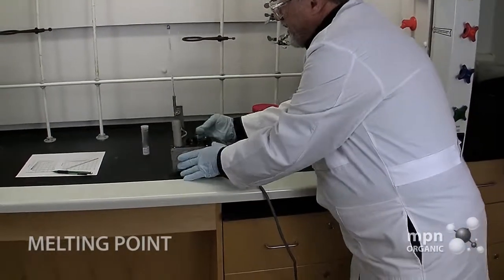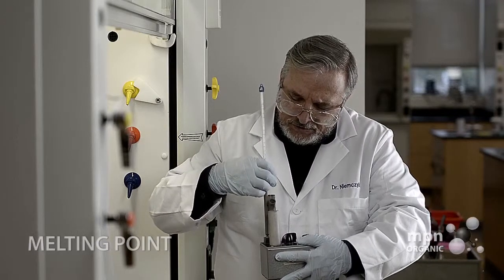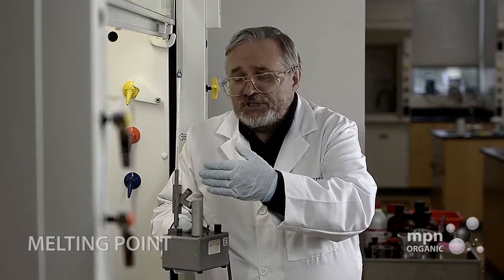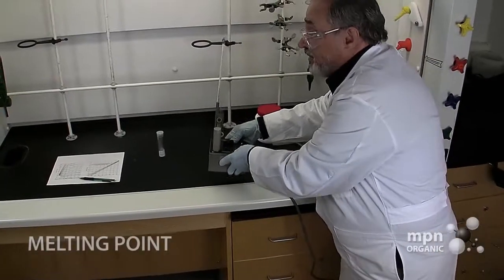Now we're going to put the sample in this sample holder right here. The MeltTemp has provided three such positions in this sample holder, which means you can take up to three melting points at one time.